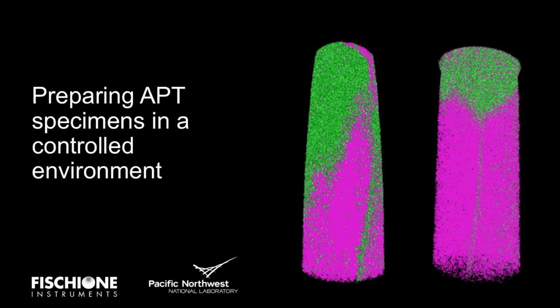And for APT, maybe Daniel can complete my answer, but as we show in that presentation, you can see even in those images that less gallium on the specimen will improve overall sample quality. And also using NanoMill, we remove that damage from the sample induced by the interaction with gallium ions.